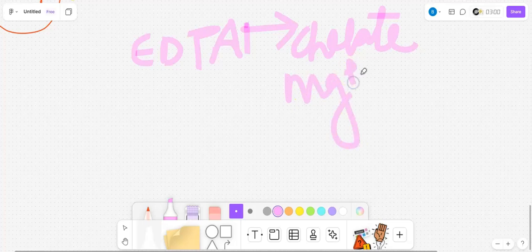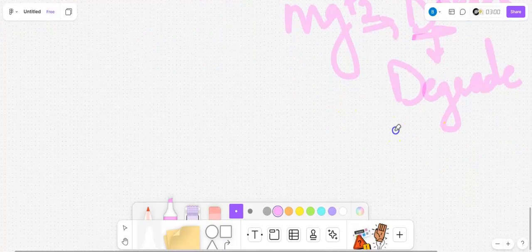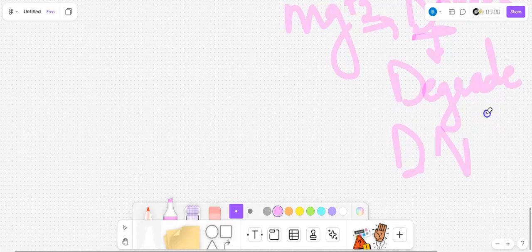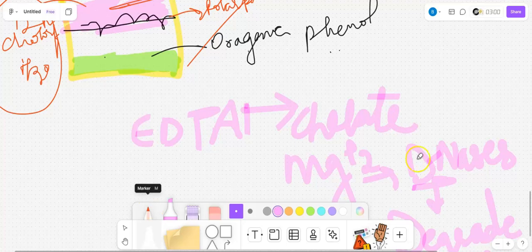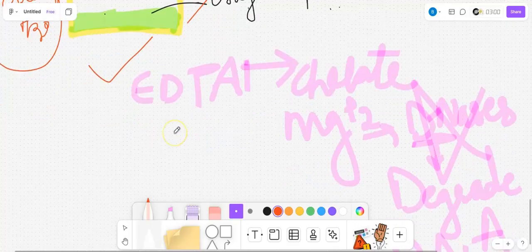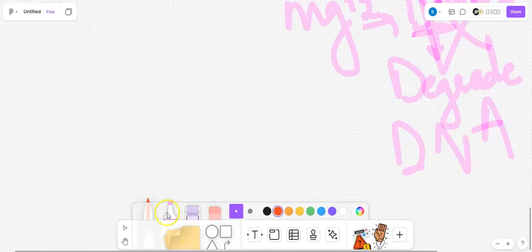Mg+2 ions ఏవైతే ఉంటాయో DNases లో, అంటే ప్రోటీనేసెస్ ని రిమూవ్ చేసేసాం, DNases ని కూడా రిమూవ్ చేసేసాం. DNases are the ones which will degrade DNA, DNA ని డిగ్రేడ్ చేసే వాటిని DNases అంటారు. మనకి ఇంటాక్ట్ గా కావాలి కాబట్టి we will destroy these DNases. ఈ DNases ని డిగ్రేడ్ చేసేయటం వల్ల ఆర్ ఇన్యాక్టివేట్ చేసేయటం వల్ల we will have our DNA intact. So for that, we will use EDTA in that solution also. This is one. And then alcohol precipitation perform చేస్తాం.